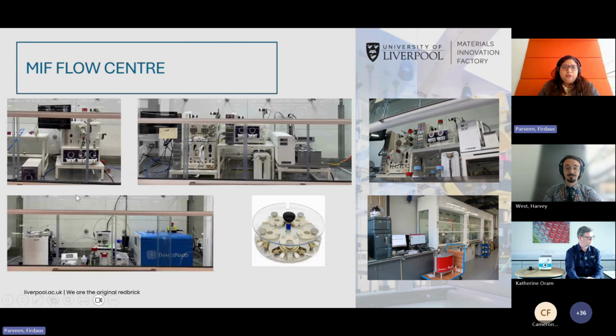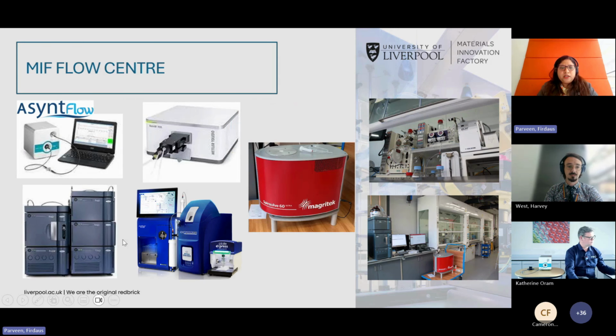At Flow Center, we have different flow reactors, including the F reactor from Asynt, and we have different analytical probes: Asynt Flow UV, Mettler Toledo IR, different LCs and NMR.